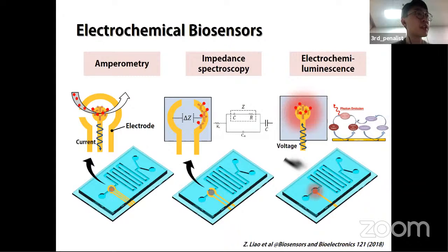The most distinctive feature of electrochemical sensors is the ease with which they can be miniaturized for high throughput, low cost assays with rapid detection time and high sensitivity. Achieved through microfluidic fabrication technology, the integration of multiple electrochemical sensors into a microfluidic chip has attracted considerable attention as an outstanding candidate for miniaturization.